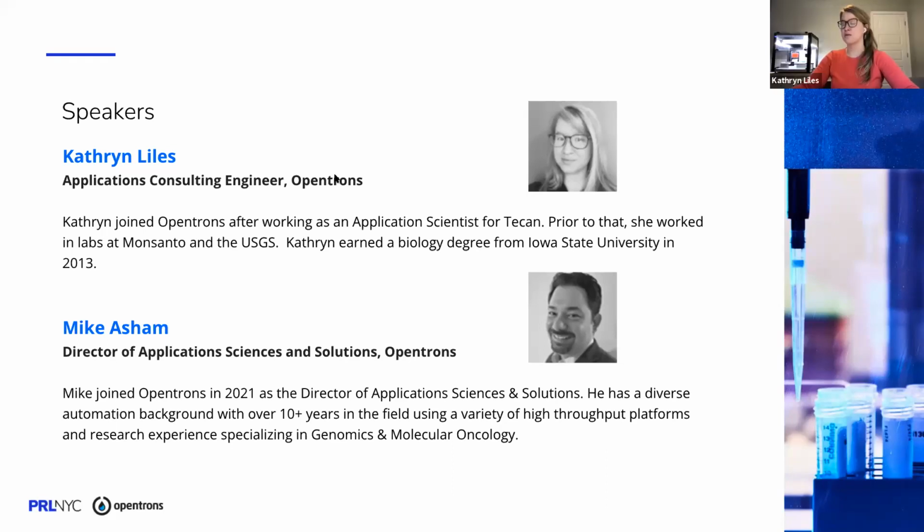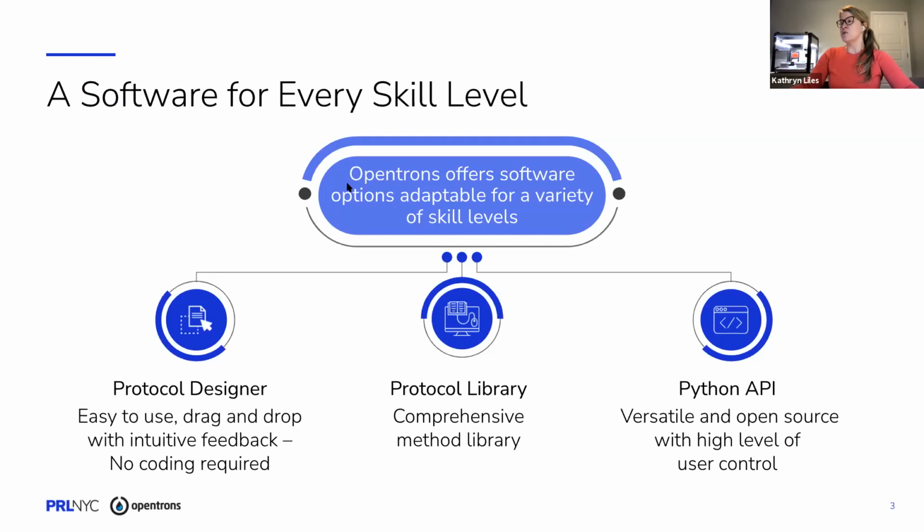All right. Good morning, everybody. Thank you for joining us for the webinar today. So today we'll talk about the Opentrons Protocol Designer as a way to generate protocols for the OT2 without any sort of coding needed. So just a quick overview.